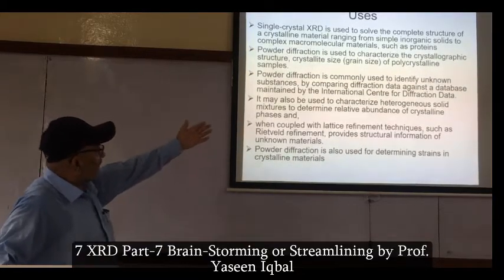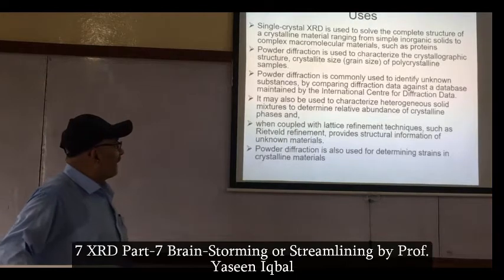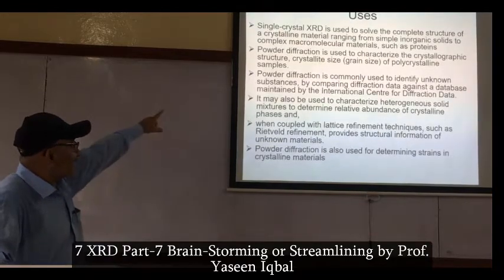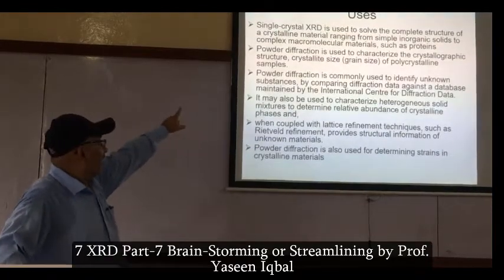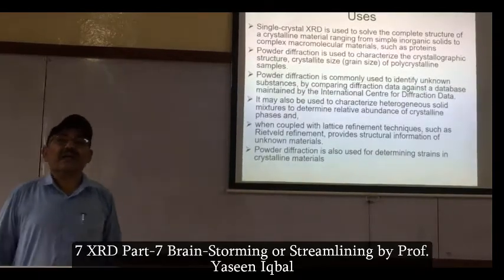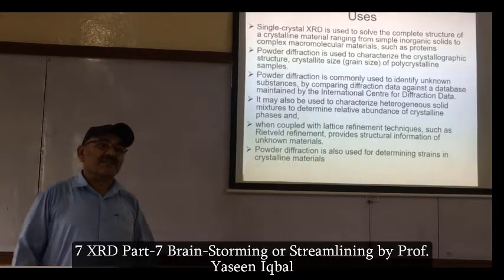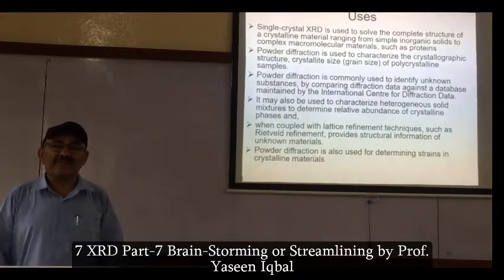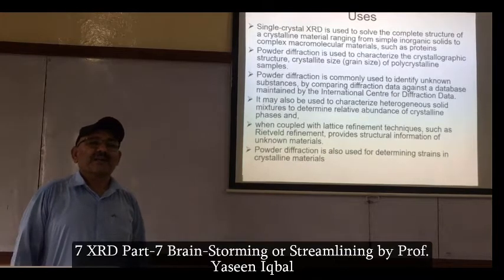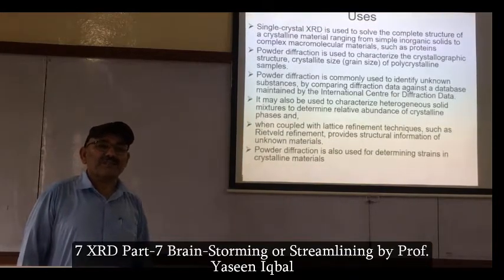By comparing the diffraction data against a database maintained by the International Centre for Diffraction Data, this sentence, powder diffraction is commonly used to identify unknown substances. If you are technically speaking, you are not identifying unknown substances.